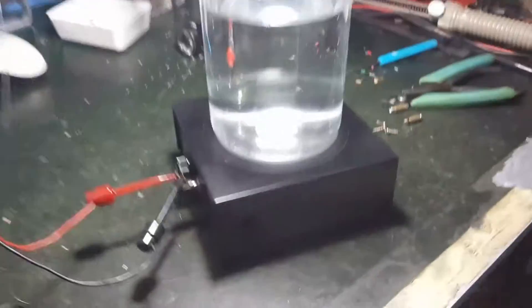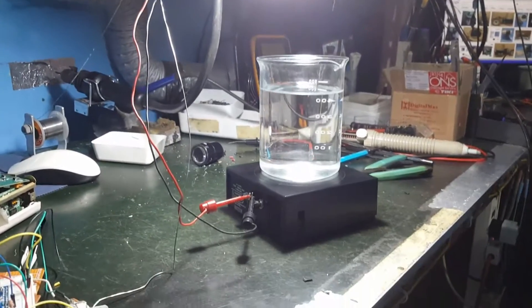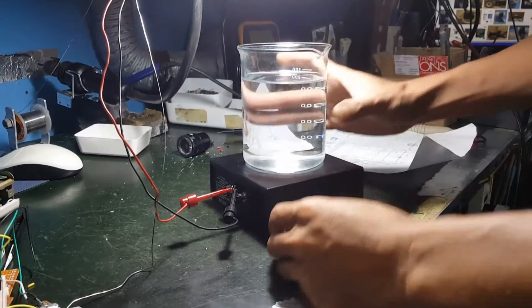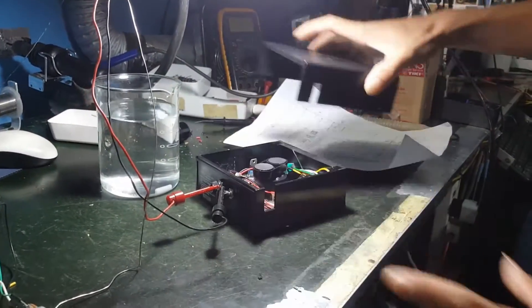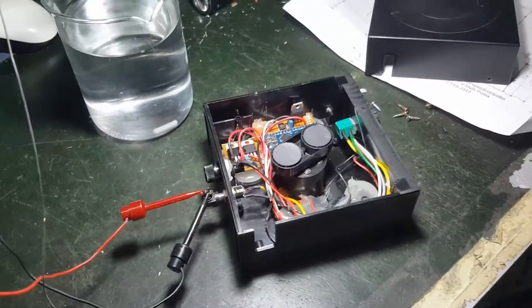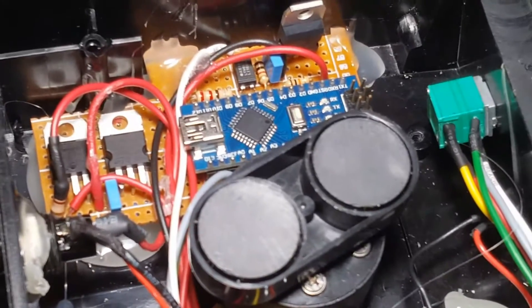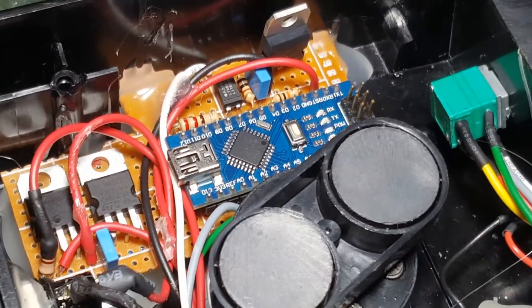So I can show what is inside — we replaced the circuit. I'm not bound by the original restriction. This is the replacement circuit; you can replace it with any Arduino. We used an Arduino Nano.